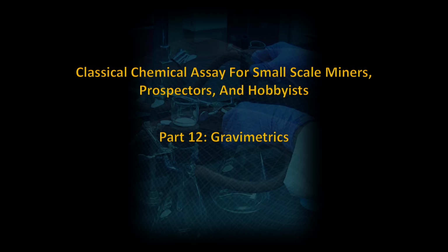Gravimetric analysis is the oldest and is considered to be the most accurate method of analysis used. It is also the lengthiest and most tedious method to perform. This presentation is the starting point in our discussion of quantitative analysis for elemental concentration determination.